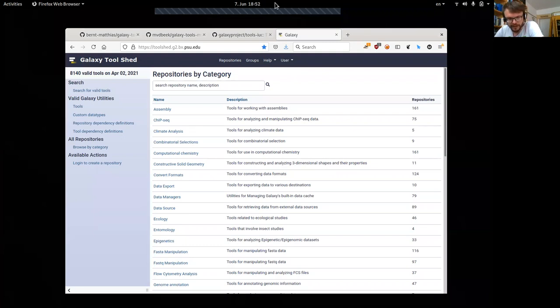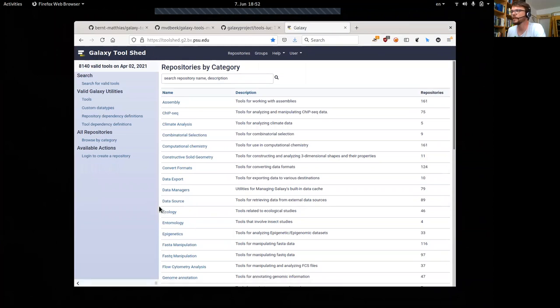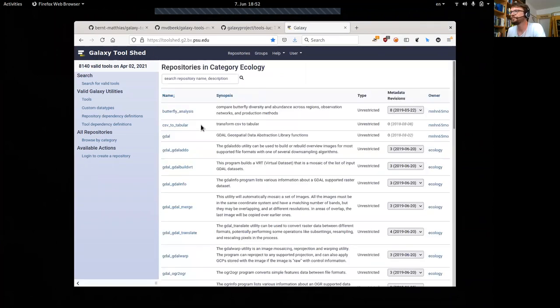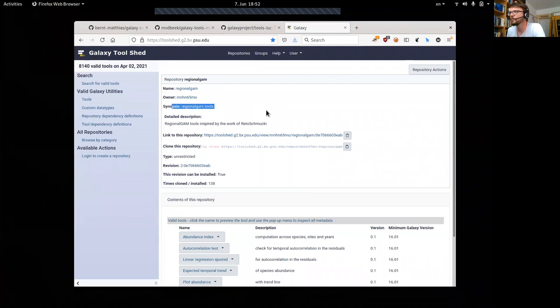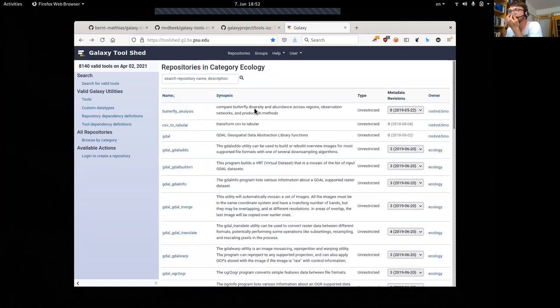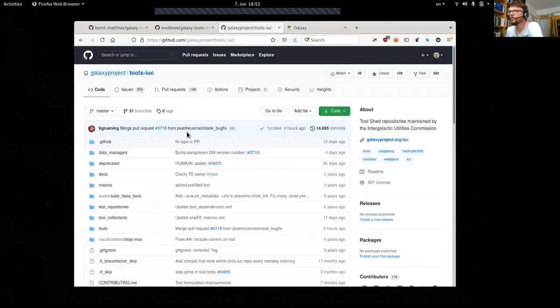In this part of the tutorial we want to explain how to contribute tools for Galaxy. Ultimately all tools end up in the toolshed, where they are categorized into different categories. Picking a random tool, you can see a description, a link to the original repository, and also revision history. This is all managed with Mercurial, which is somewhat a remnant of the past. Most tools nowadays sit in GitHub repositories.